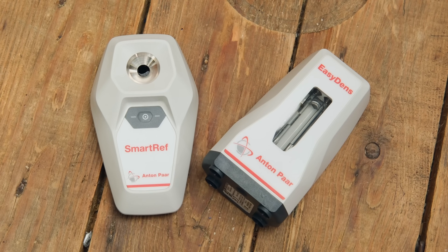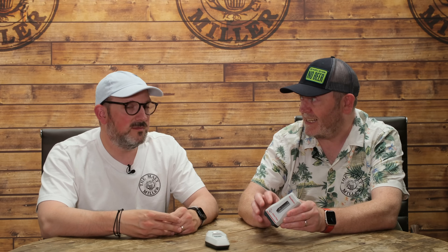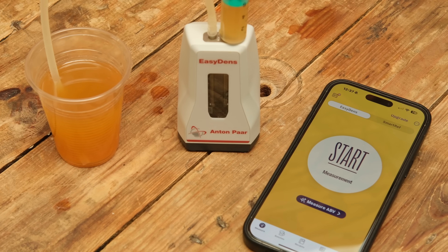And it's specifically lab, really high quality equipment that they produce. Now they've gone and produced two devices which you can use on small scale and home brewing. These are built to the same quality as the things you will find in any professional brewery, but what they've done is they've cut some of the costs out by linking it to your home device — like a smartphone or a tablet — so there's no screen technology built into the device. Exactly, so this is feeding the data to your device so you can take the readings on that.